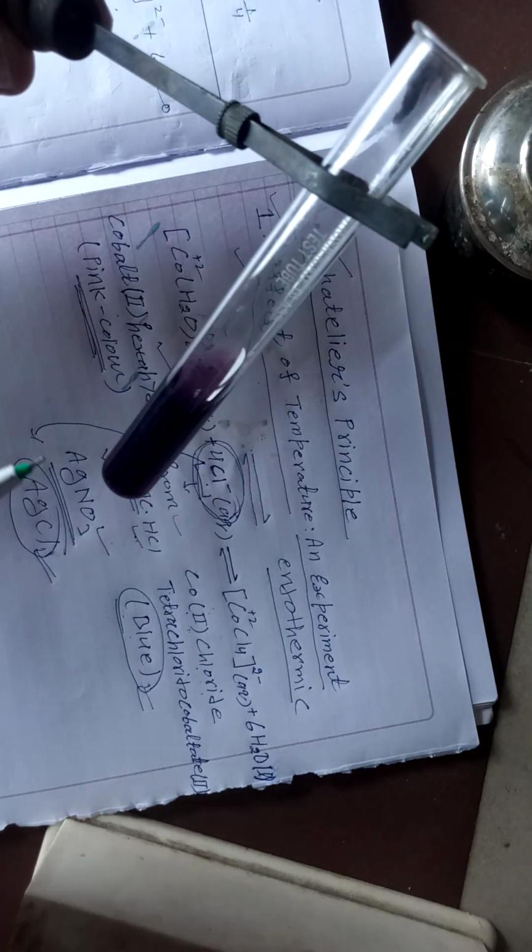After heating we can observe that its color becomes blue.